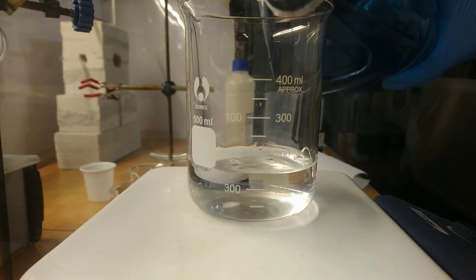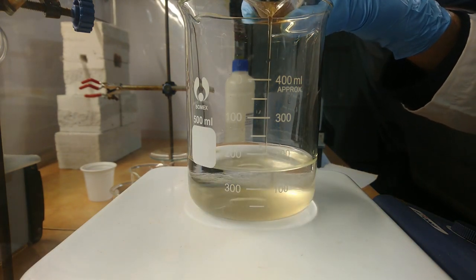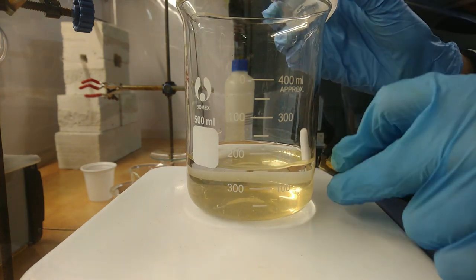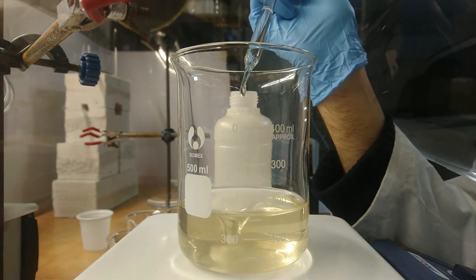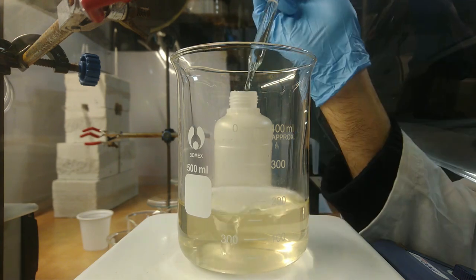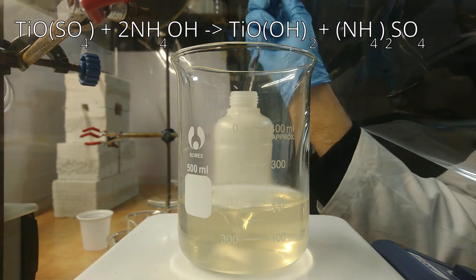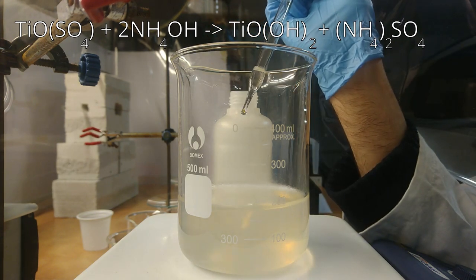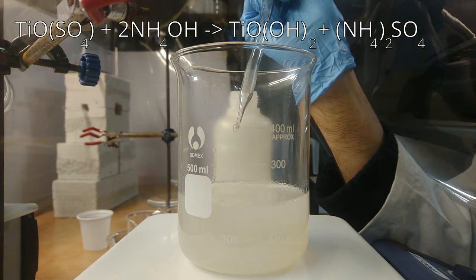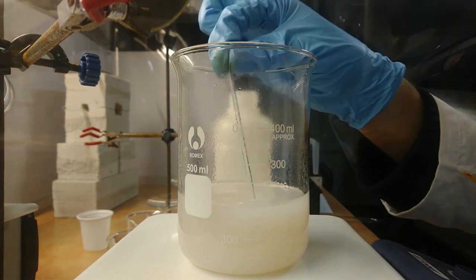The acidic solution is then diluted by pouring it into a large beaker with 150 ml of deionized water. We then need to bring the pH to neutral by adding around 30 ml of 25% ammonia. Check with pH paper in order to add the correct amount of ammonia.